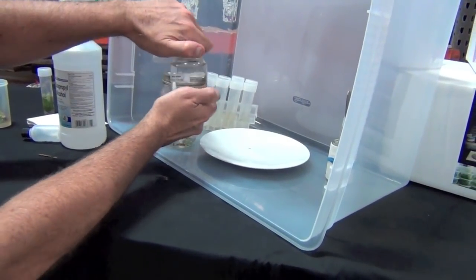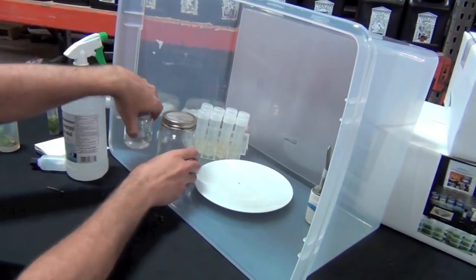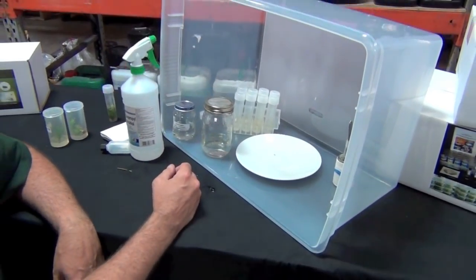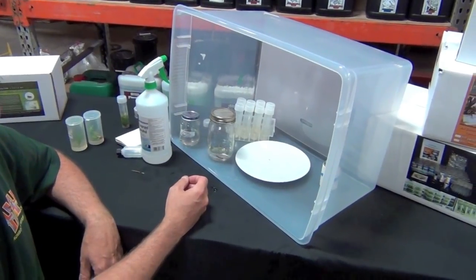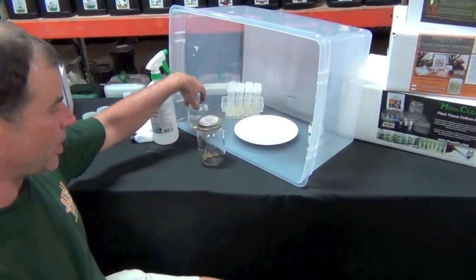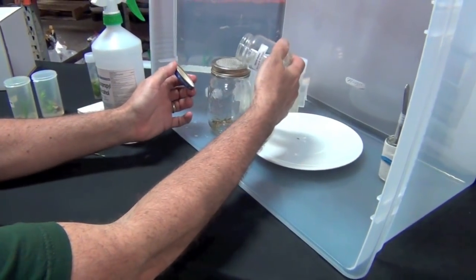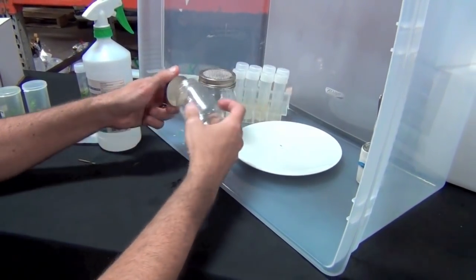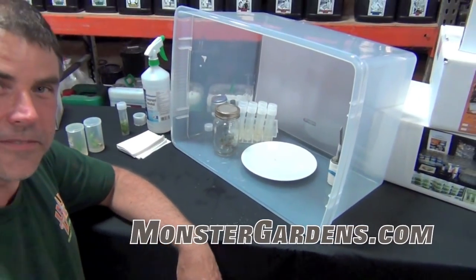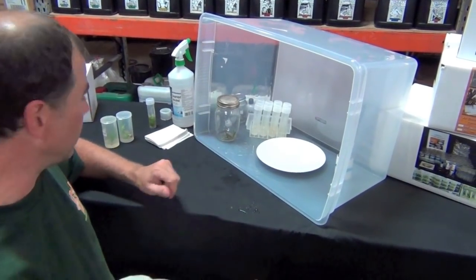This is the sterile water rinse. I'll open the jar and pour that in — usually about half — and give it like two one-to-two-minute soaks to bring down the concentration of peroxide. We just want to clean the outside of the plants. We'll drain it in the sink and do that one more time — this is the second sterile water rinse. I have now drained the sterile water solution, so we're ready to put plants into culture. I'll take my plate and first put a couple sprays of alcohol on it to clean the surface. The plants are clean now and the inside of this jar is clean — everything the plants touch from now on needs to be sterile clean.